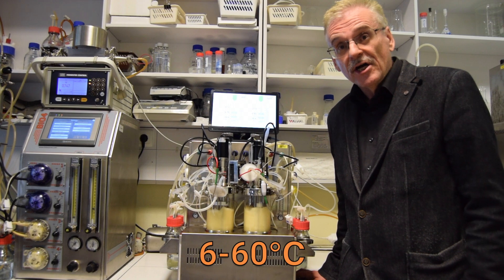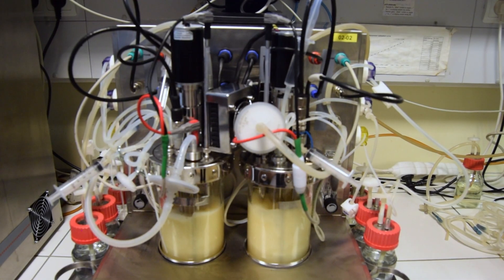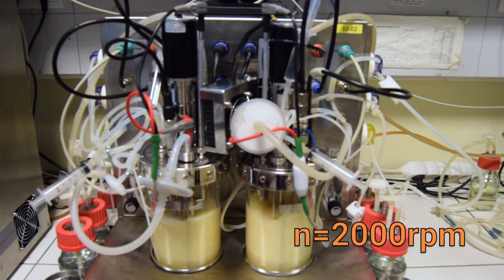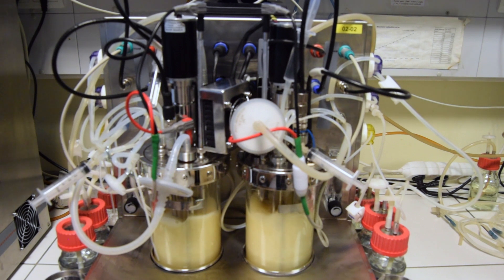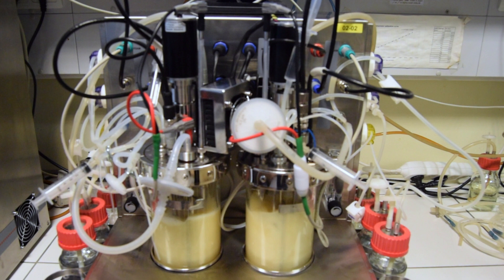The controlled temperature range is from 6 to 60 Celsius degrees. Magnetic coupling ensures sterile maximum mixing rotation speed up to 2000 rpm. It is now achieving in the right vessel 1400 rpm under dissolved oxygen cascade control — this is already very intensive mixing.